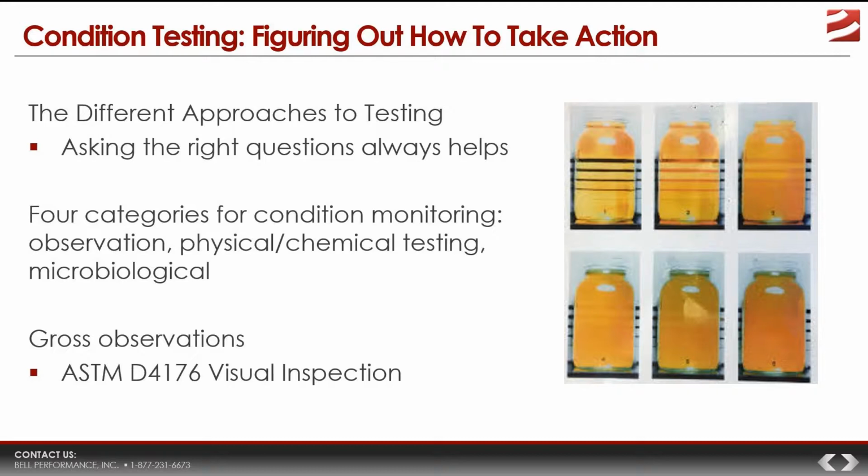So we get a fuel sample. Now we're going to assume that it's a good fuel sample. We're going to assume that we have done our best to get ourselves a good, viable fuel sample. So we look at it. We look to see if it looks different. You could smell it. Are there characteristic odors? You pull a fuel filter media.